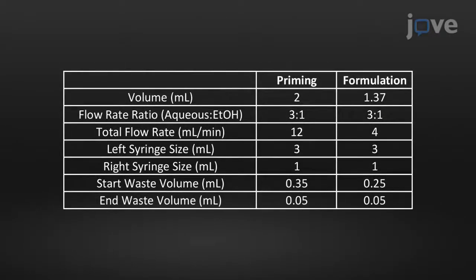To prime the microfluidic channels, first enter the priming parameter into the instrument software as outlined in the table.